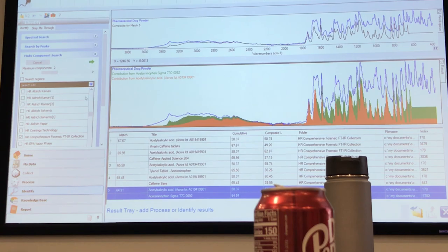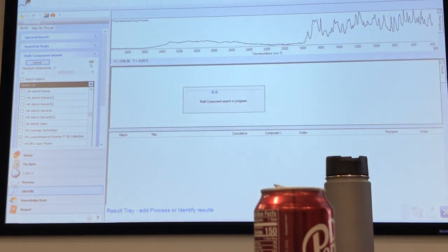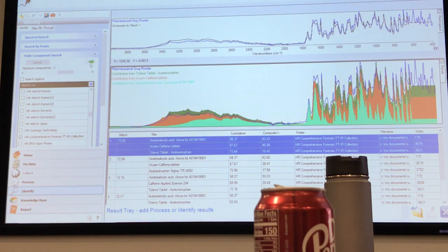So what we do is, let's increase the components now. I'll tell it to go do a search for three components. That means it has to look for three different ones. It will do one more round where it is going for the third residual, so first, second, then looking for the third. And you're not specifying the type, you're just saying three. Just look for three components.